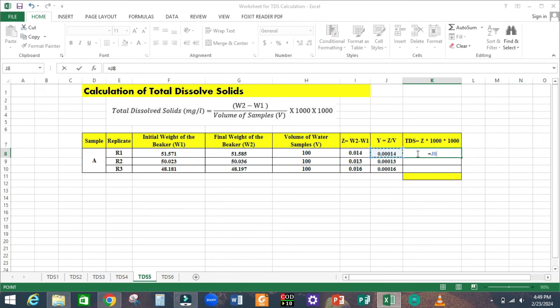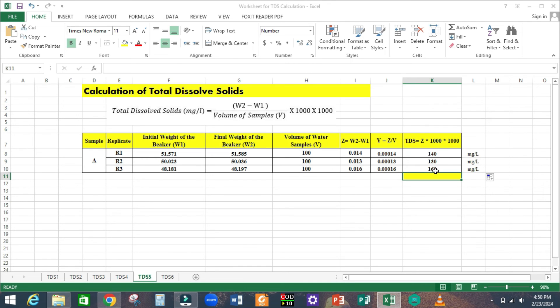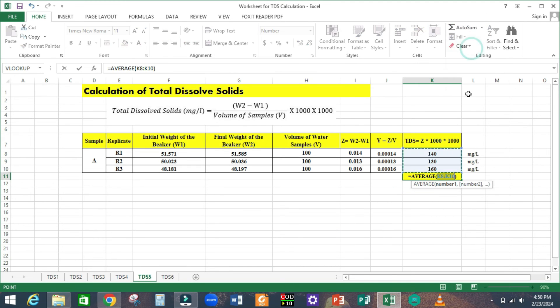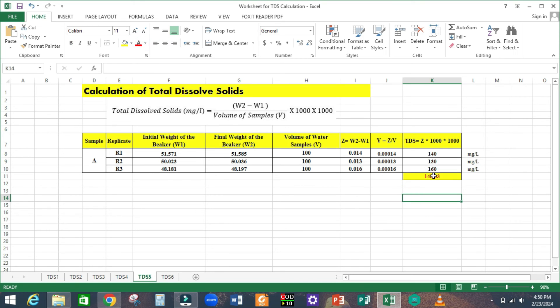Multiply Y by 1000 into 1000 to get the TDS values. Double-click to fill down. R1 gives 140 mg per litre, R2 is 130 mg per litre, and R3 is 160 mg per litre. Finally, calculate the average. The mean concentration of total dissolved solids in the analyzed sample is 143.33 mg per litre.